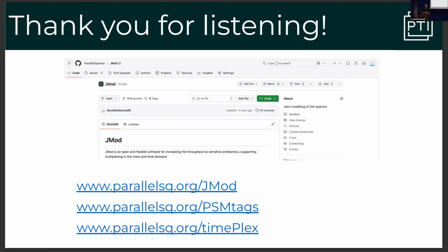So is this multi-column approach also possible on the timsTOF? On the timsTOF, yeah. So this is, I guess, the next step. Some of the third-party software we're using to work with timsTOF data just didn't work out in time for this particular preprint, so it's not currently available for timsTOF data, but will be shortly. That's our main priority now.